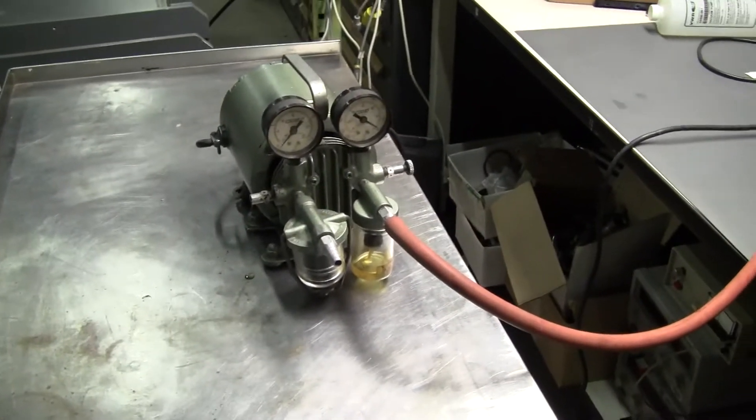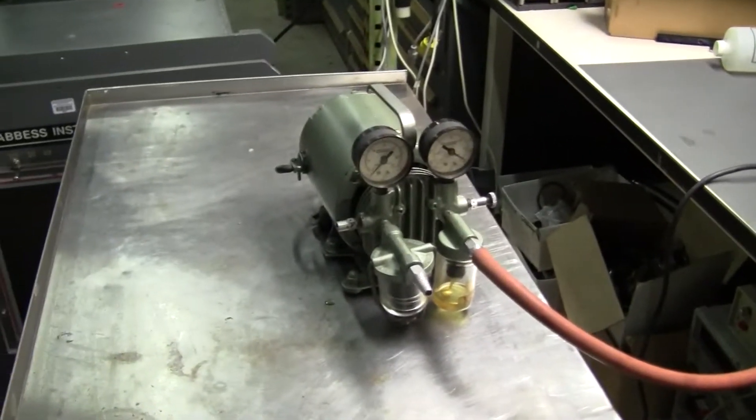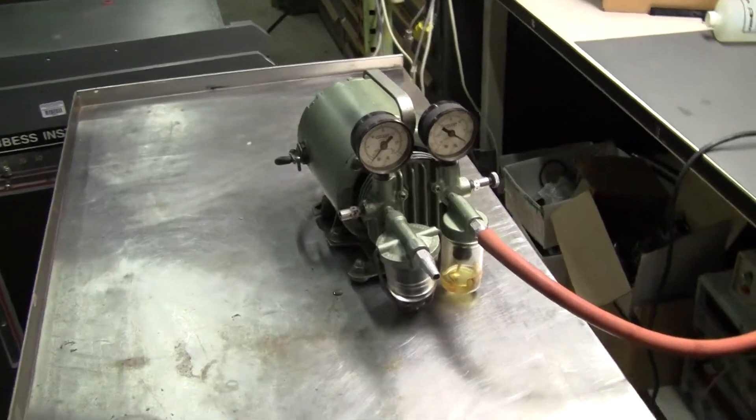Got two gauges up here on the front. I have this hooked up to our meter here so that we can see what kind of vacuum this is pulling in a second.